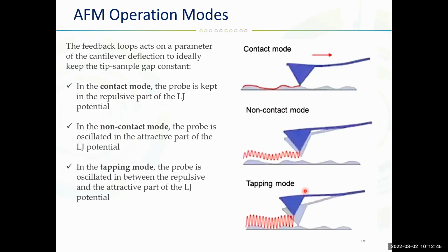As a result of the repulsive force between the tip and the sample, the sample may be damaged or changed by the scanning process, because your tip is constantly touching your sample. In the other way, the tip can also be damaged or changed by the scanning process. So you should choose the mode depending on the type of your tip and your sample, and vice versa. The tip and the sample are constantly in contact with each other, so in addition to the normal force that they apply to each other, lateral forces are experienced by both the tip and the sample.